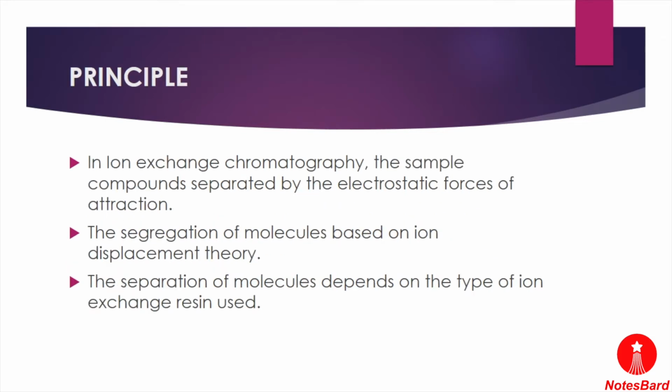Now let's discuss the principle on which the ion exchange chromatography method works. In ion exchange chromatography, the sample compounds present in the sample mixture are separated by electrostatic forces of attraction. Electrostatic forces are forces used by molecules to attach themselves.